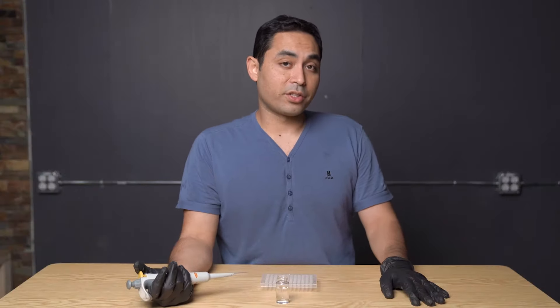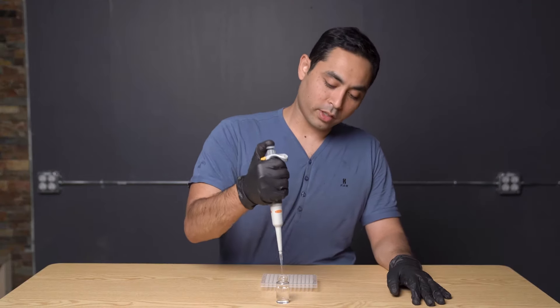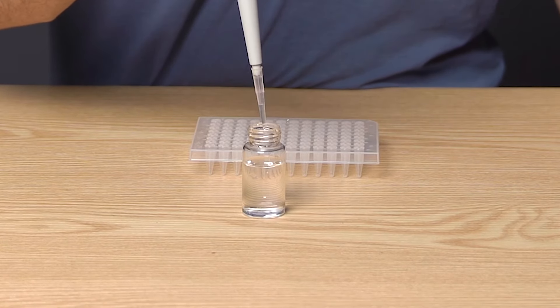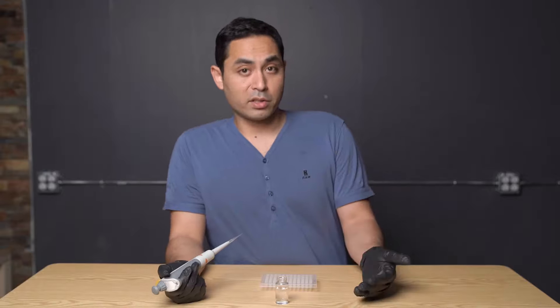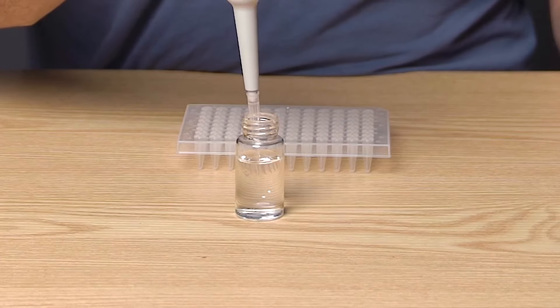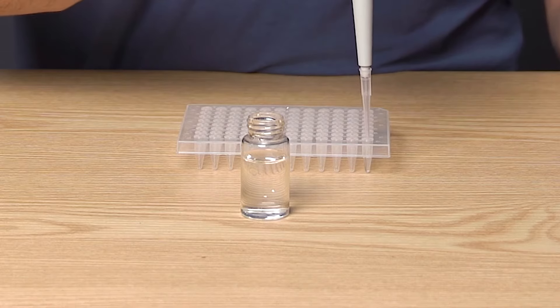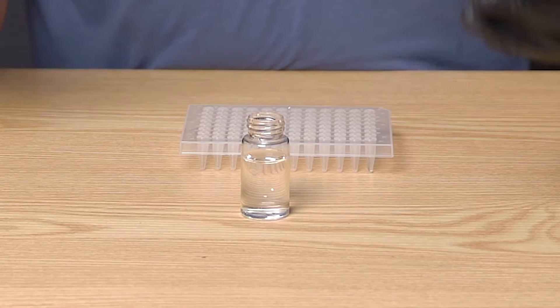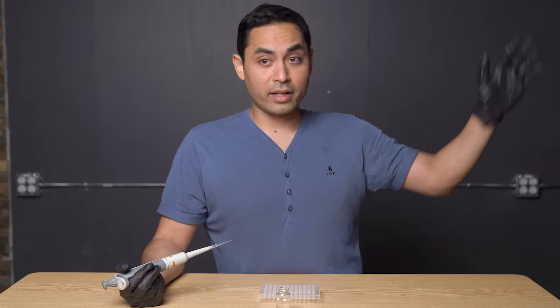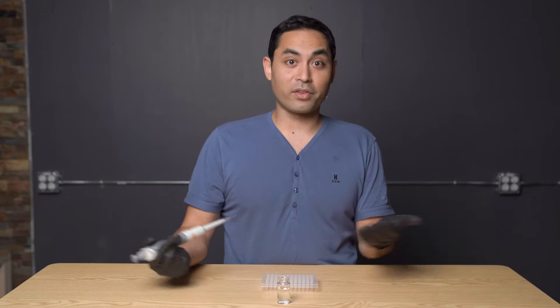The fifth thing is to make sure you have proper pipetting rhythm — it's all about smooth and steady motion. You want to pipette the same way every time. If you pipette too fast, you might not dispense the right amount of liquid. A smooth rhythm leads to very consistent results, which is why different operators running the same method can get different outcomes — a lot of it comes down to rhythm.